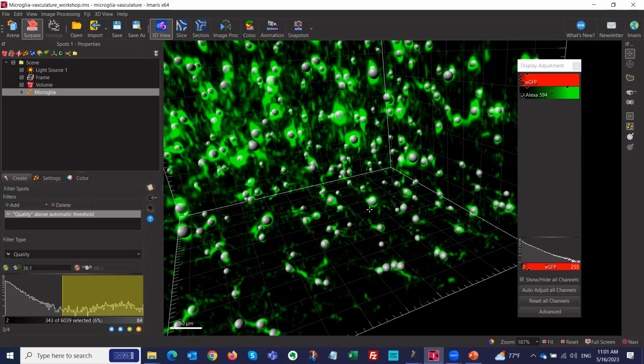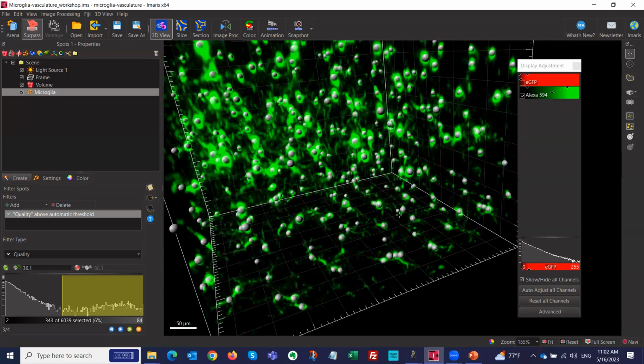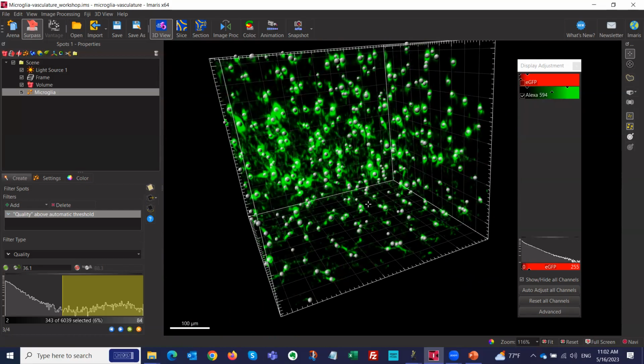And even if it doesn't pick up one or two, that's typically one error that I personally, and it depends on each of the researchers, could neglect, because it's better comparable to a second and a third and a fourth and a 100th data set. It's a systematic error, I don't know which one it is, but it's an error that continues on from one image to another, so it's more comparable. Okay. If you have just one data set, you can also manually add spots afterwards or delete some spots. Okay, that's also not a problem.